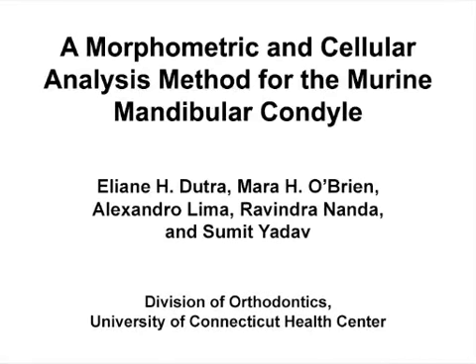The overall goal of this experiment is to observe the effects of compressive loading in the mandibular condylar cartilage of mice, using morphometric measurements in radiographs and histological analysis. These methods can help answer key questions regarding the structural and cellular changes within the mandibular condyle of rodents.